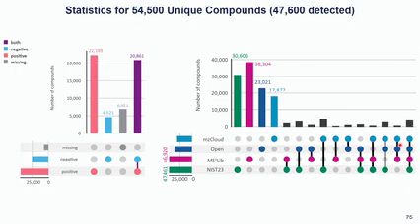Then on the right side, we also wanted to compare the uniqueness of our library compared to other databases. So we combined the open ones, MassBank EU, MassBank North America, and GNPS, as one that you can use for querying. And then mzCloud and NIST23 as the biggest commercial libraries that you can use. And they do great work, but it's just to see that if we all work together, we can actually increase the public domain a lot. And you see we are almost, with MSnLib, it's the magenta one, we are close to NIST23 in terms of unique compounds.